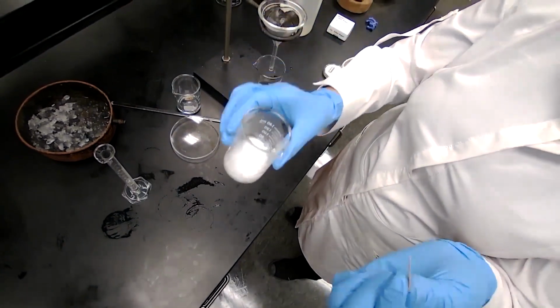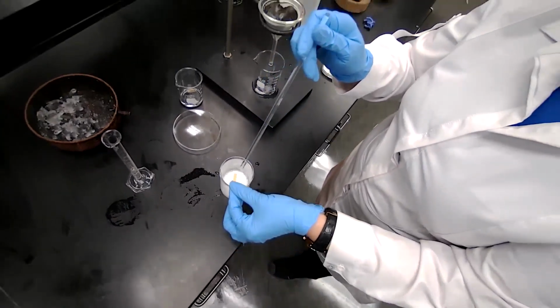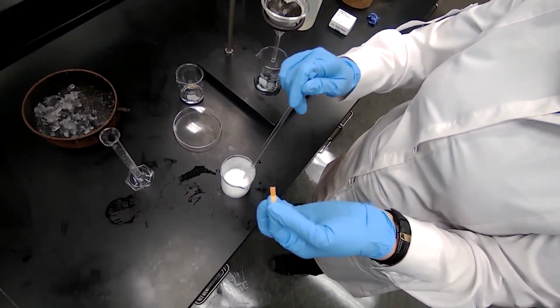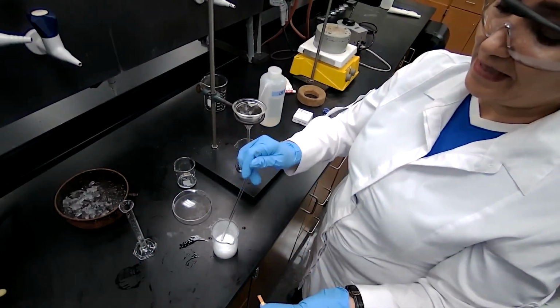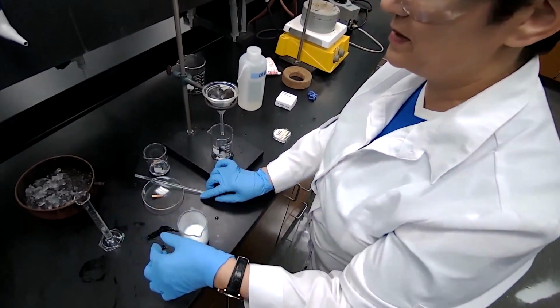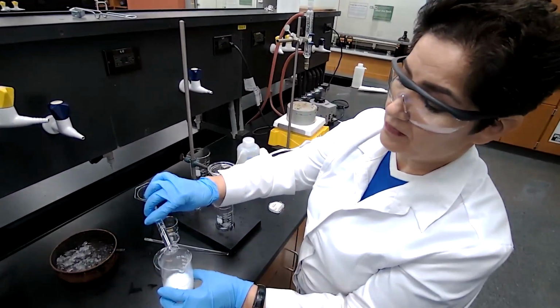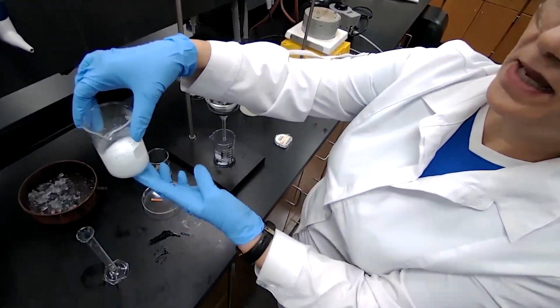We want to make sure the solution is acidic, especially if you don't have this white precipitate form. You have to check the acidity. If the precipitate forms, it's obvious that it is acidic, because benzoic acid is not soluble in acidic solution, but it is soluble in basic solution. So if the solution is still basic, you should not get precipitate. So I'm just adding the rest of the 10 milliliters of the HCl that I had measured.